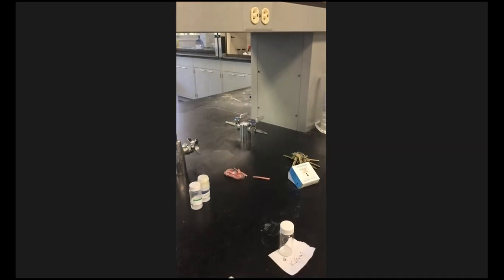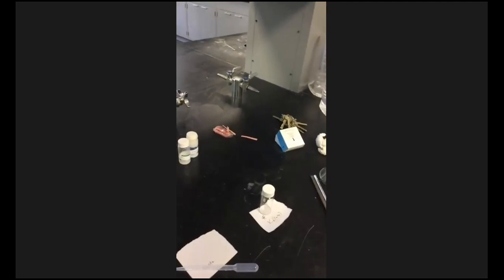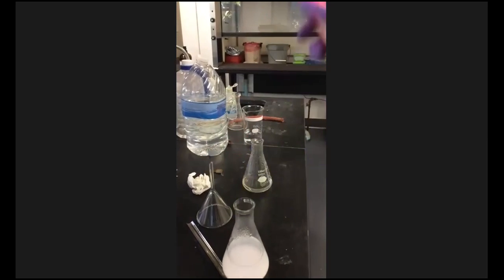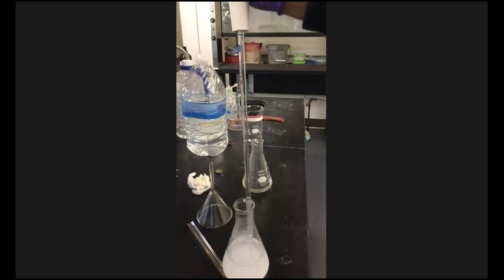I don't know if you've ever seen one of these before, but there's a little wheel up top, and you just roll it to pull a solution up. So let me do that right quick. So here's my solution. I want some of that good clear stuff at the top. So I'm actually going to take out 2 milliliters. I'll take out 3.